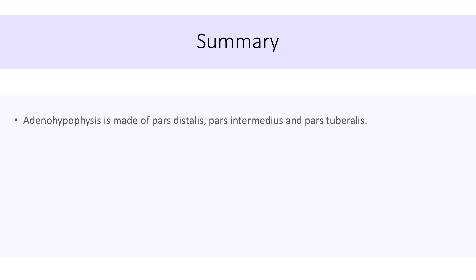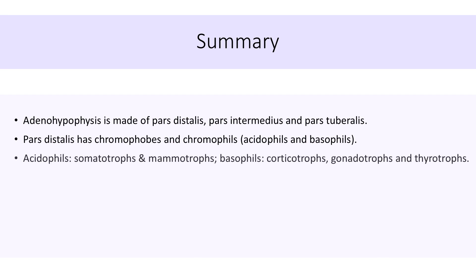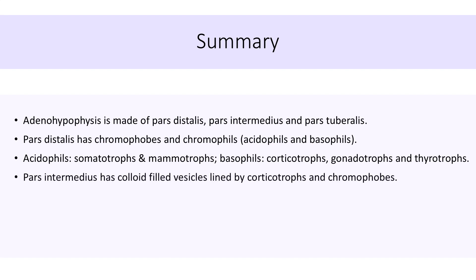To quickly recollect: adenohypophysis is made up of pars distalis, pars intermedius, and pars tuberalis. Pars distalis has chromophobes and chromophils; chromophils are of two types, acidophils and basophils. Acidophils include somatotrophs and mammotrophs, while basophils include corticotrophs, gonadotrophs, and thyrotrophs. Pars intermedius has colloid-filled vesicles lined by basophilic cells, likely corticotrophs, and chromophobe cells.